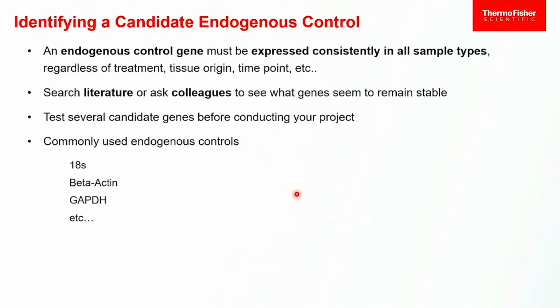You can trust other people and pull from publications. That's fine too. I have had it happen enough that what I'm doing is slightly different from what previous researchers were doing. My process is slightly different, and I have trouble trusting implicitly what's in papers, personally. You're an experimenter. You get to choose those.